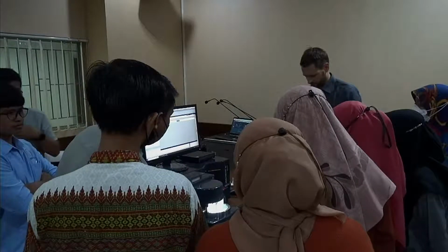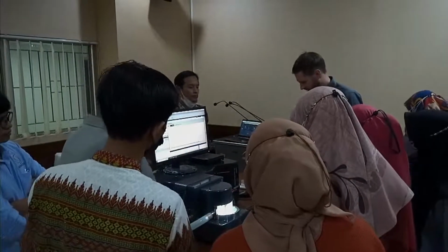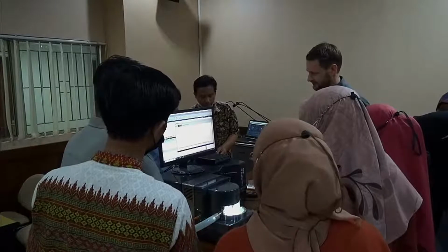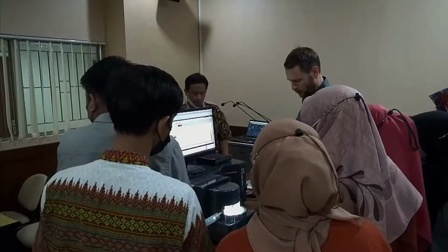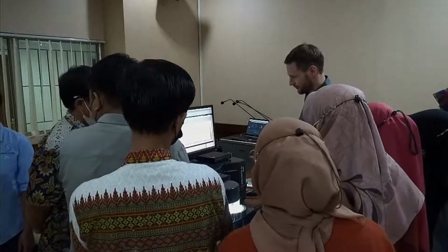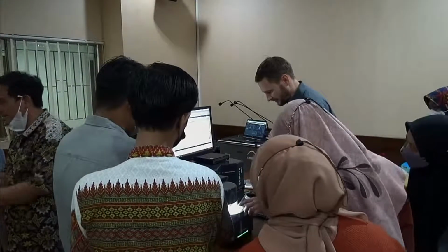Now I check the amount of material we have in here. I could use the pipette, but it's already occupied. I'll just pour it in very, very carefully, directly. Usually you would work a little bit more diligently with sample adding, but we're limited in equipment and limited in time, so we just do things the way they come. It's also something to prove to myself whether I have a good feel for it.